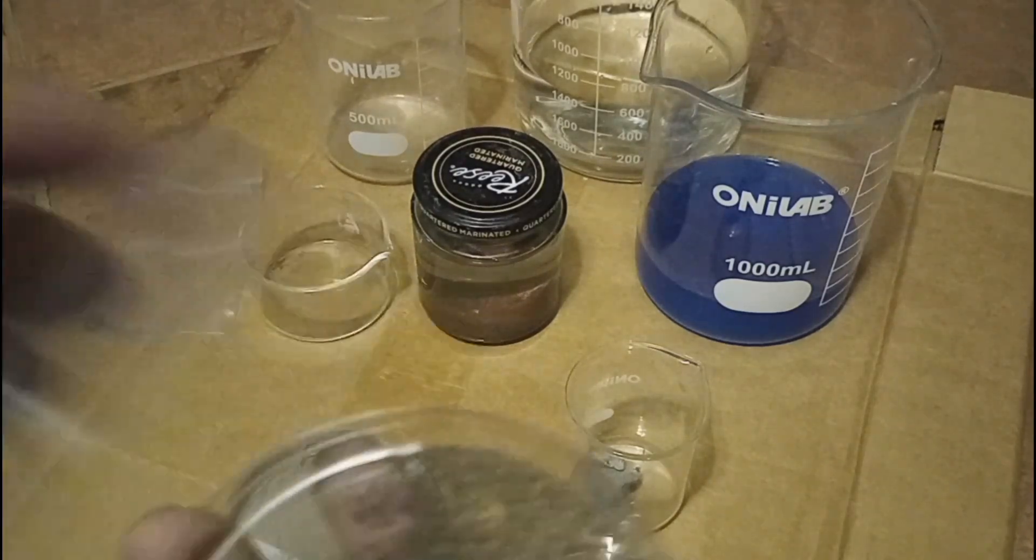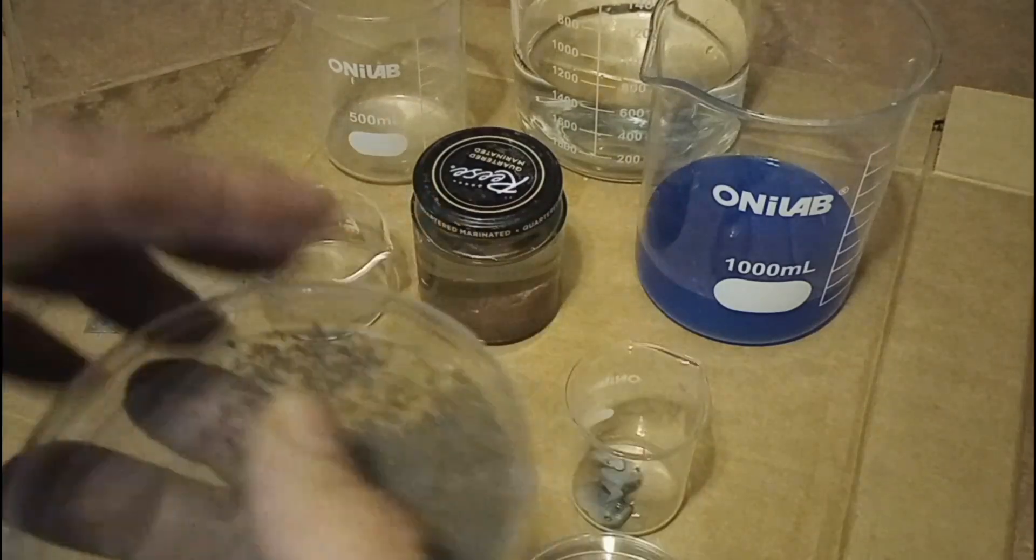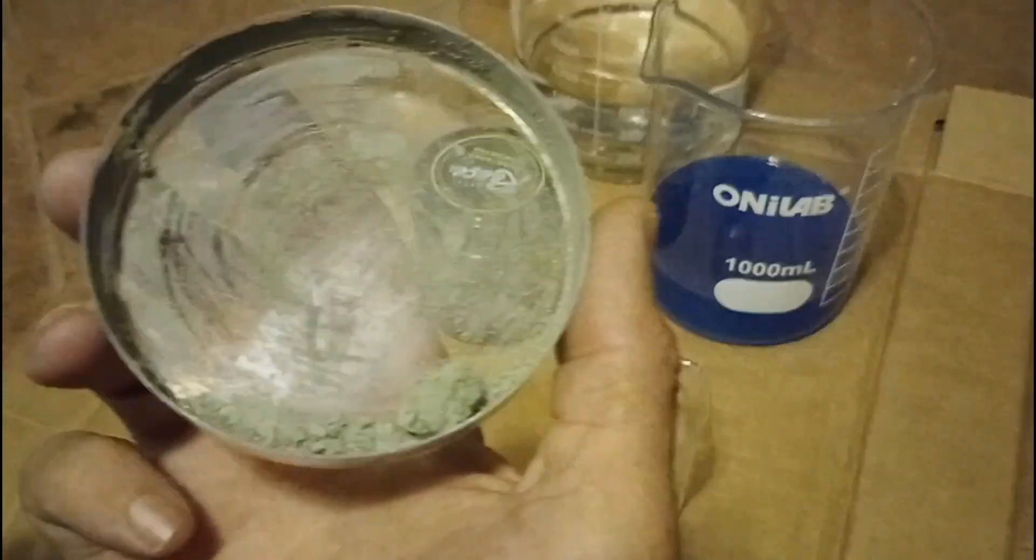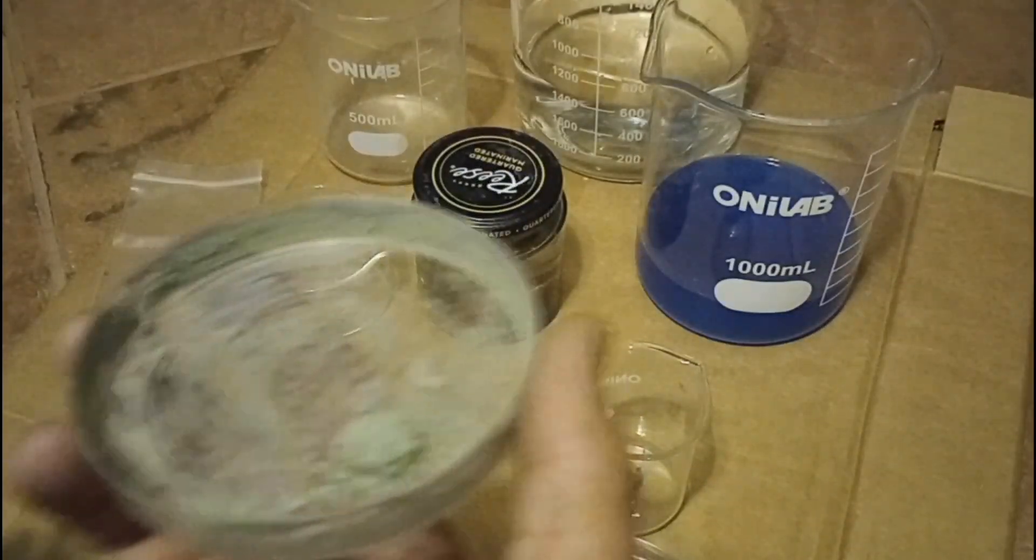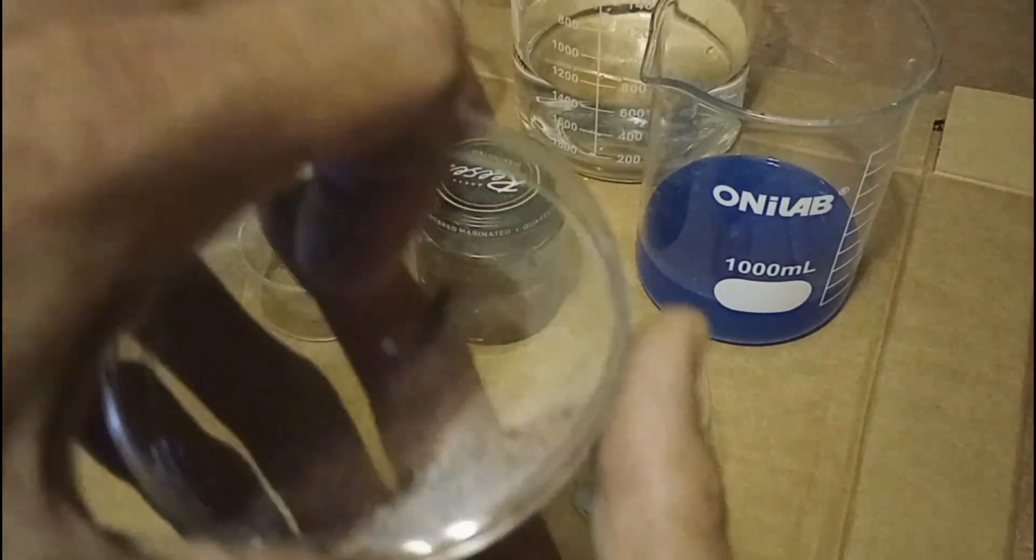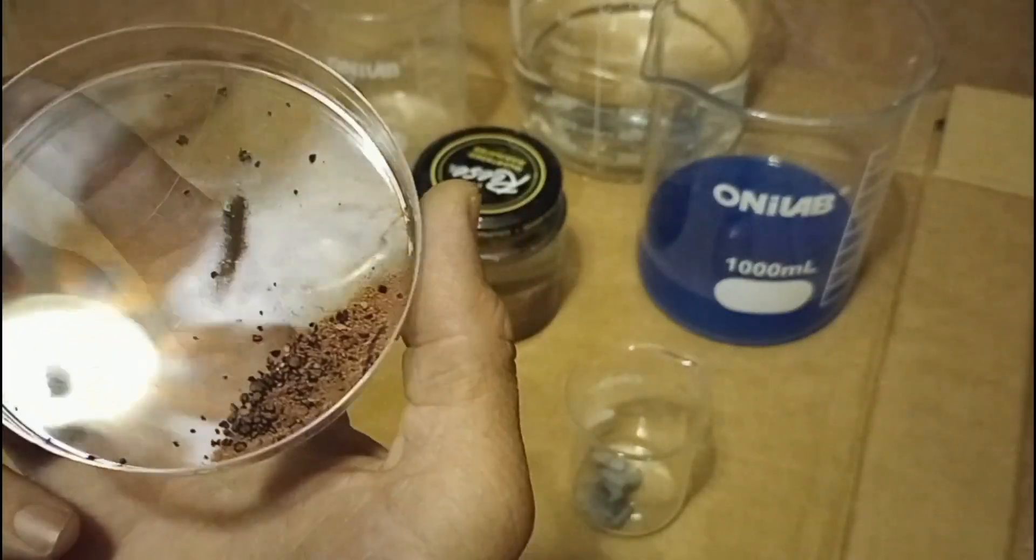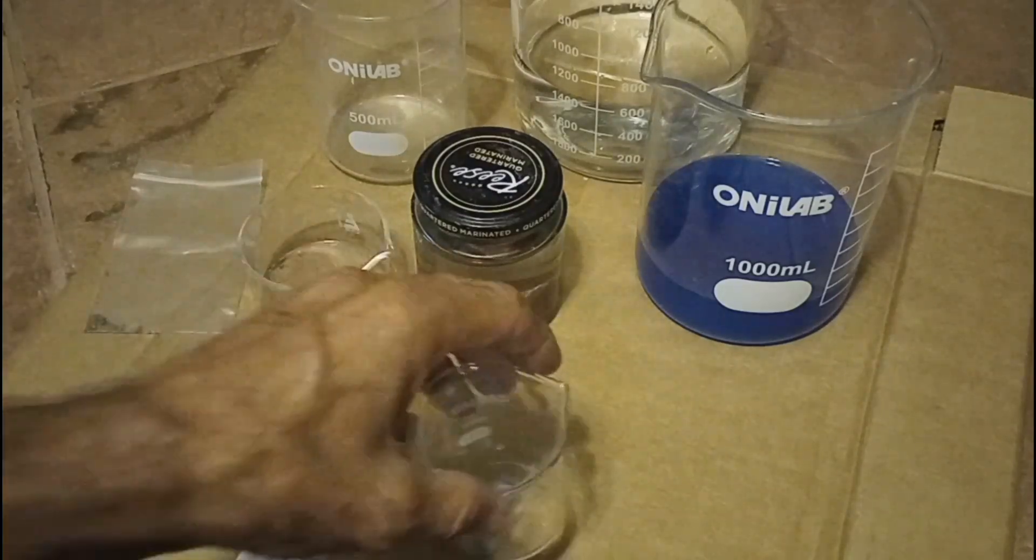So this is everything we accumulated from the first 4 episodes. This is the undissolved particles of brass. This is all of the sediment which may contain silver. This is the copper substance with the black flakes in it from the last video. These are the zinc strips that were used in the last video.